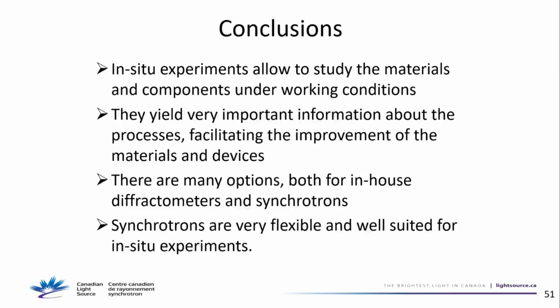I have a very short question. You said you're talking about controlled gas and temperature also. Is it possible to do this in-situ analysis for a compound under high temperature and under a specific gas? For example, argon, nitrogen, ammonia. Is it possible for you to do it?